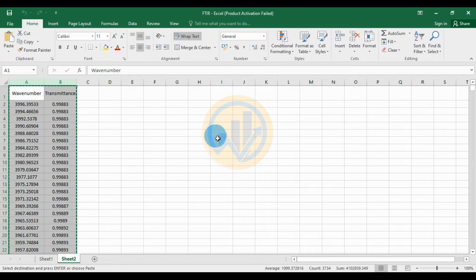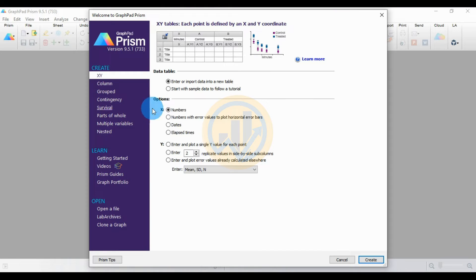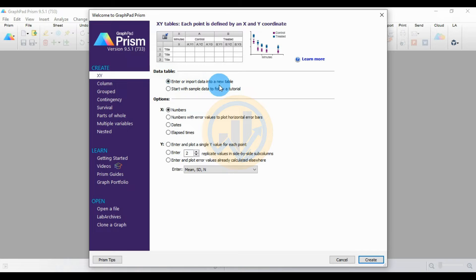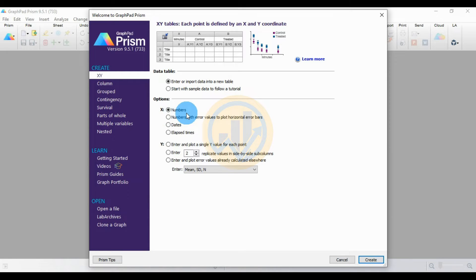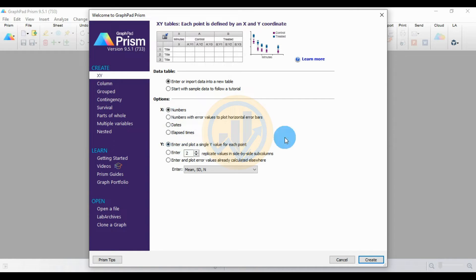Go to GraphPad Prism software. Select the 'Create' option. For the X-Y data table, select the option to enter or input data into a new tab. In the options menu, set X to 'Numbers', then set Y to the first option: enter and plot a single Y value for each row.